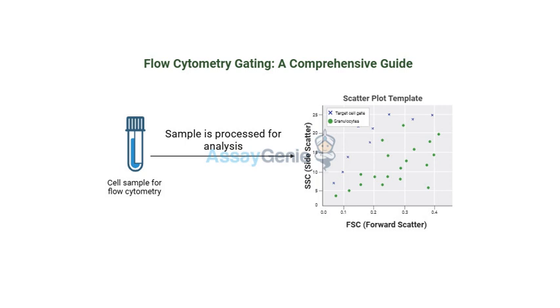That does sound a bit futuristic, right? Basically, dimensionality reduction helps us simplify these really complex data sets and lets us see high-dimensional data. Okay, I'm all about keeping things simple, especially with data. But what exactly does high-dimensional data even mean when we're talking about flow cytometry? So remember how we measure a bunch of different things for each cell, like the size, granularity, and all the different proteins they have? That's like giving each cell a detailed profile.